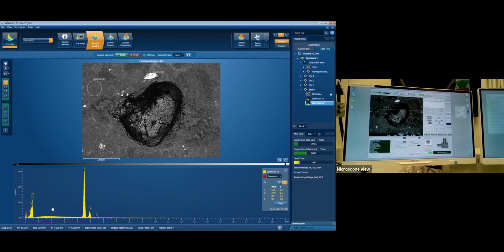So I should specify as well, this little graph bit, these peaks aren't telling you how much of each element is in there, it's just how strong the signal is. So this is in counts per second, I think. God, it's CPS per electron volt. Yeah. Yep, so that's basically just telling you how much of a signal it's getting. It's not telling you how much of the actual element is there.